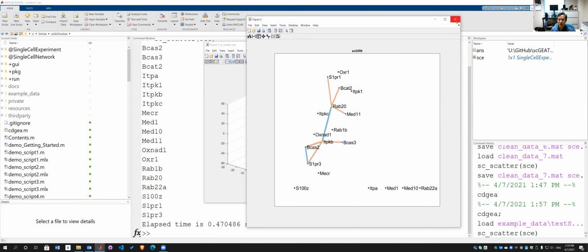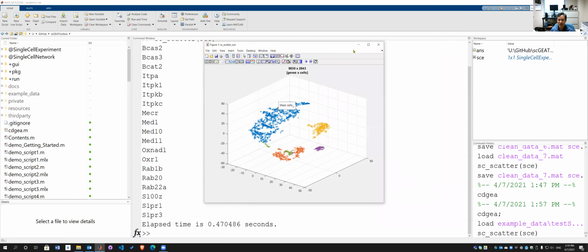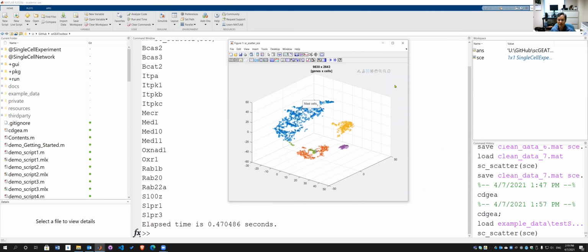All right. So this is the one analysis you can build for your gene set. In order to build the cell type specific ones, for example, I want to build a network for these yellow genes only. So I can highlight, for example, what this gene, the cell type, okay? Pyramidal cells number 5. So I can click this button, which is select cell by class.